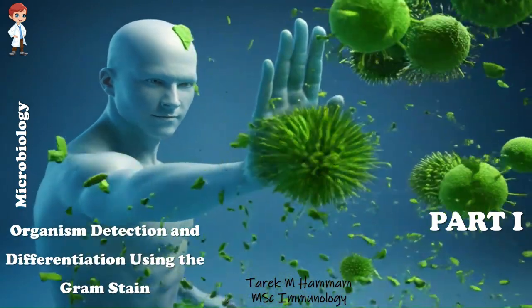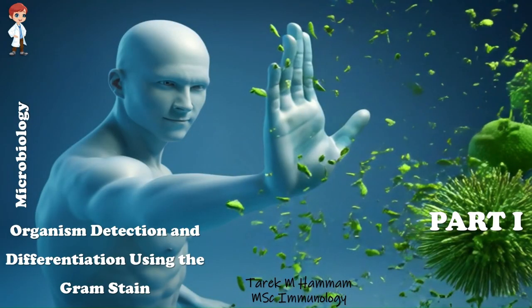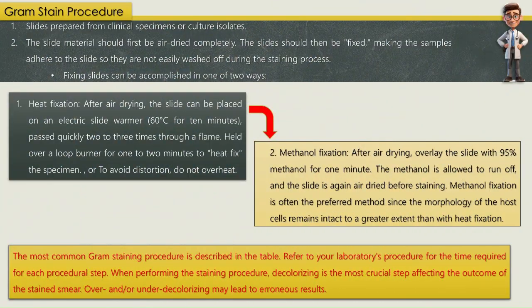Microbiology. Organism detection and differentiation using the gram stain. Gram stain procedure. 1. Slides prepared from clinical specimens or culture isolates. 2. The slide material should first be air-dried completely.